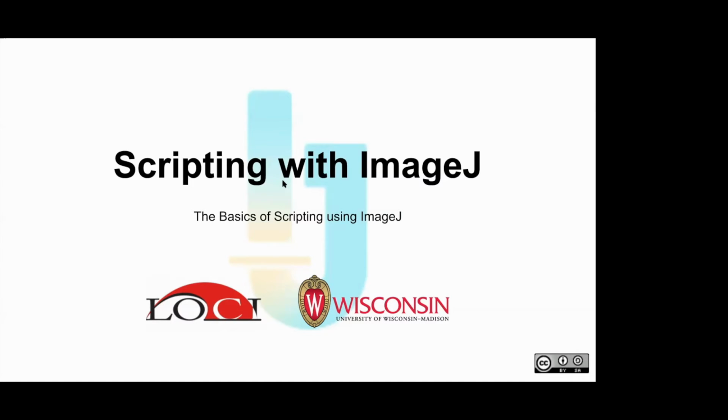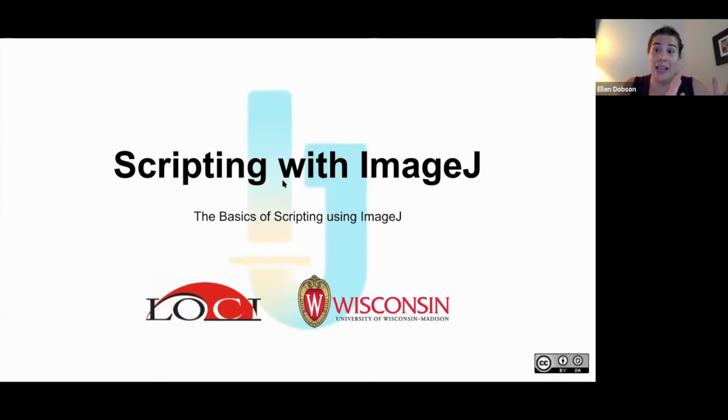Yes, you can do that. In that case, you can measure as many channels as you want, as long as you don't have overlap in your antibody signal, since DAPI has a pretty broad readout. So it's possible. You just have to check the signal from DAPI and your particular antibody, whichever fluorophore you're using, so you can easily distinguish what is signal coming from DAPI and signal coming from your specific antibody.